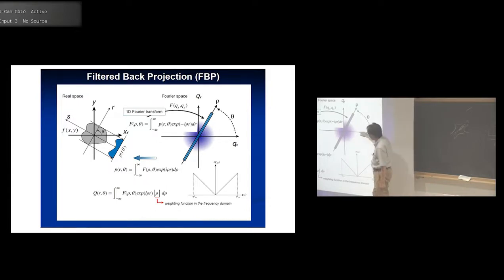So it means that as you take many projections at different angles, and then take the Fourier transform of each projection, and try to fill the Fourier space, then this inner part is oversampled compared to the outside. So this weighting function reduces the intensity, the coordinates, so to say, and that's the weighting function. So this is quite similar to this equation, except for this. So this is convoluted by this weighting function, and then it's going to be a projection, sort of. That's where I got confused.